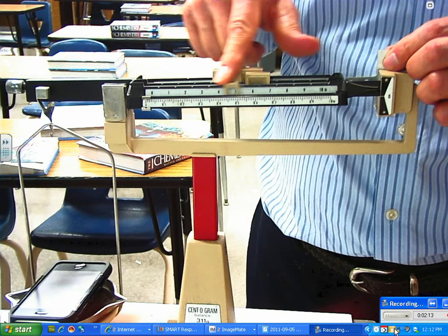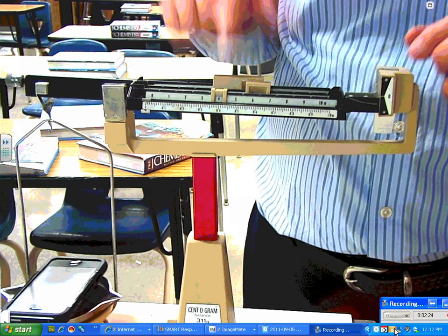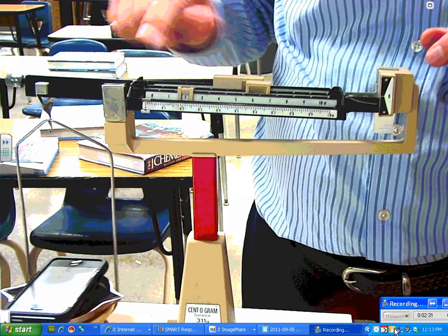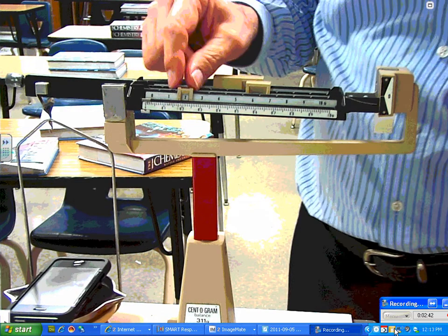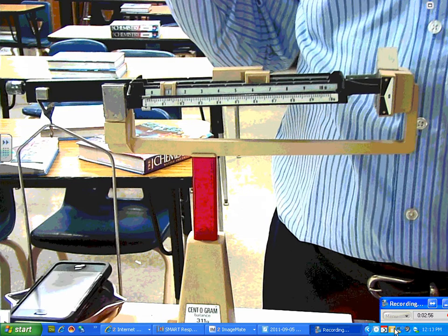I'm going to go to my third slider. This registers one gram for each notch. I move it right to the center — to five — click it in place. It goes down, so I need to take weight off by going to four, then three, two, one. At one it goes up. Since two was too much, I move it back to one, and now I know it's between one and two.